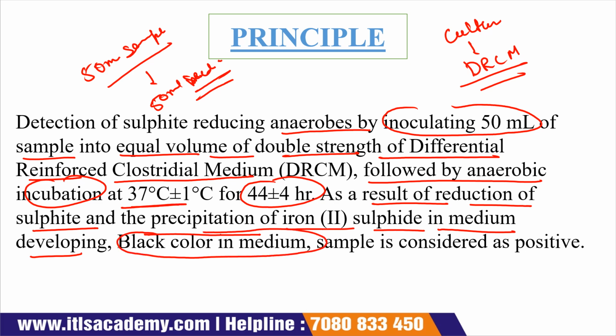Okay, if the black color occurs inside the medium, that means it gives a positive result for Clostridia. The sample is considered as positive.